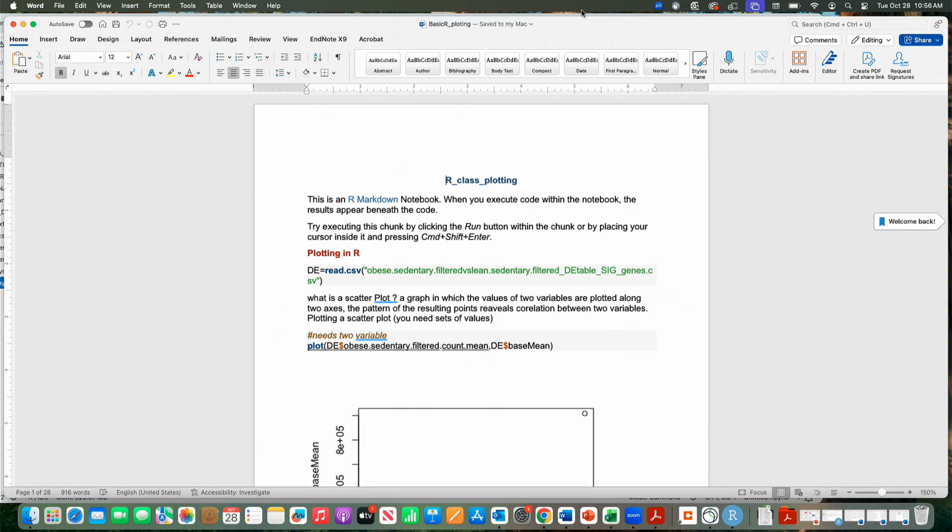Those who have already added your files, please open that Word file which says basic R plotting. Anybody need help?